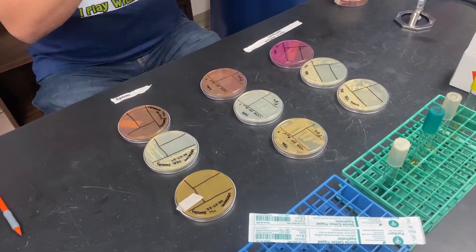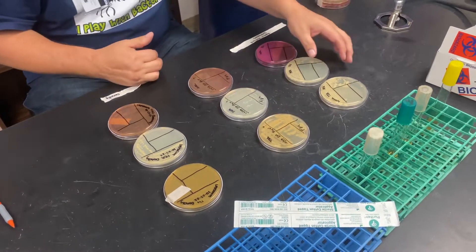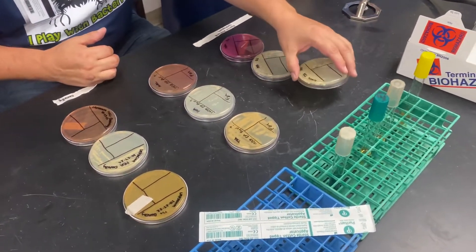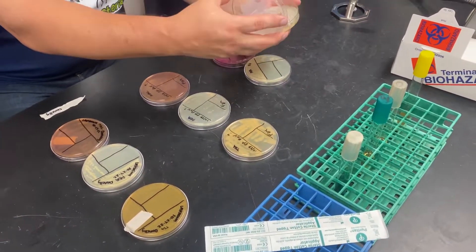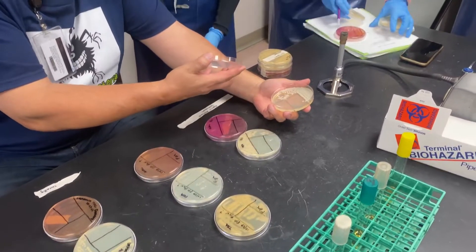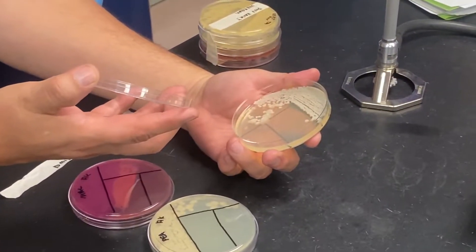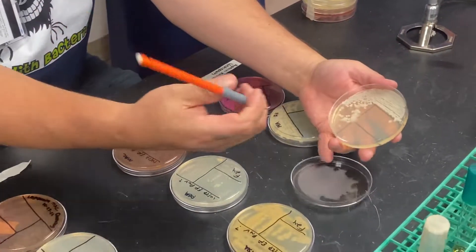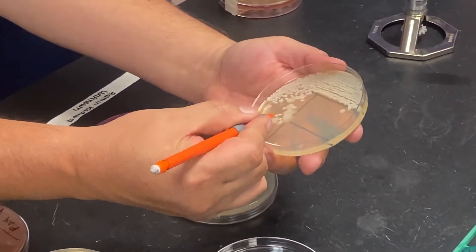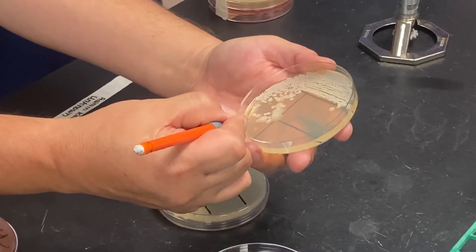So you guys, that is excellent. So now if you look at this plate, for instance, this is Alamine's plate. If you look at this plate, I have this very crusty looking organism, right? And then I have a very mucoid looking organism, crusty mucoid, right? So I see two organisms.